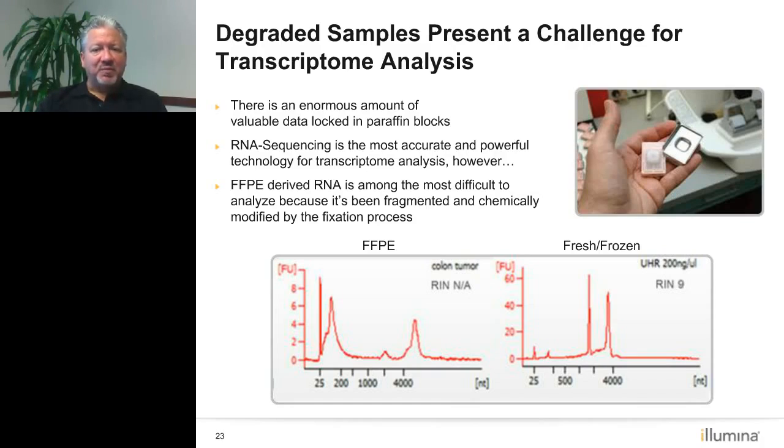But just to remind you, part of the challenge with working with FFPE samples is that, and I should remind people what I mean by FFPE. FFPE stands for formalin-fixed paraffin-embedded samples.